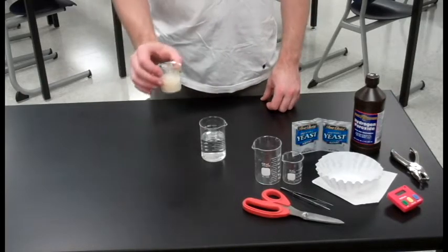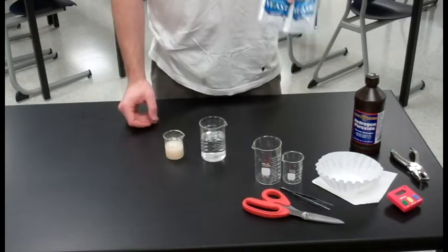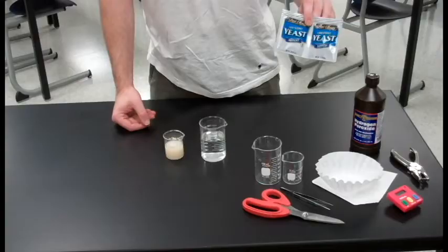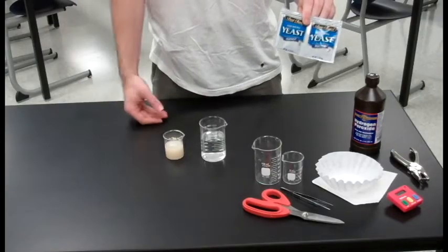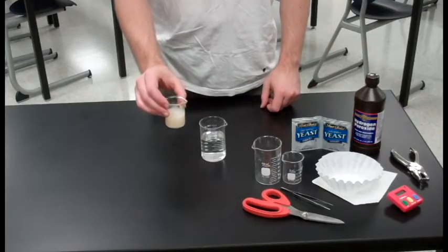The second solution is our yeast suspension. You're going to need to open up one of these packets of yeast. This is fast rising yeast, available again in any grocery store in the baking section. Pour some of that into a sample of water and mix it up.